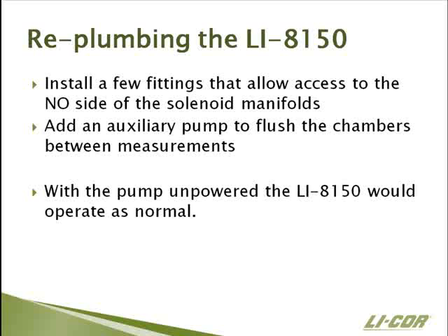And in cases where you want to look at something where the CO2 concentration or water vapor concentration or some other trace gas inside the chamber influences the flux rate, it's really important to keep it at near ambient because you're preventing these biological interactions between the gases in the chamber and the sample itself. But the nice thing about this system is that with the pump unpowered, the 8150 operates as normal. The only difference is that the mounting hole we use to mount the auxiliary pump is the same hole that's used to mount a splash guard inside the instrument, and that splash guard has to be removed to install the pump.